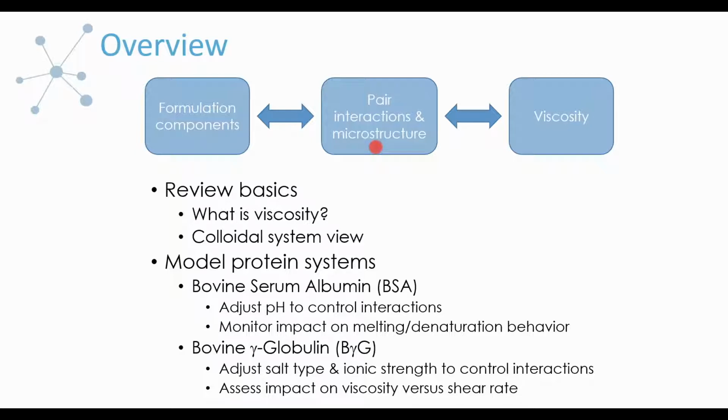I see the value, certainly from a qualitative point of view and maybe even semi-quantitative, but I do acknowledge that it's not perfect and ideal because of the nature of the proteins. I recognize that there's non-uniform charge distribution. They're not necessarily spherical, or they can have anisotropies. So I do see the differences, but I certainly think in terms of interpreting data and looking for trends that they can have value in many systems. But I am aware of limitations here.